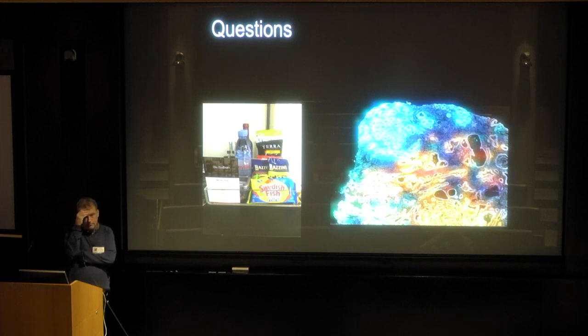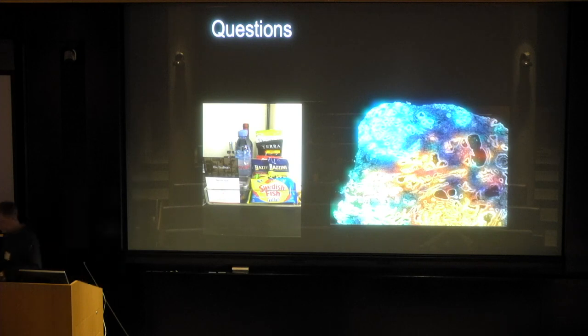Use your seat mic, please. Can you do immunohistochemistry on the same slide that you apply spatial technology, so that maybe you can look at diffuse growth factors and so forth in association with the transcriptomes? That's a super good question.